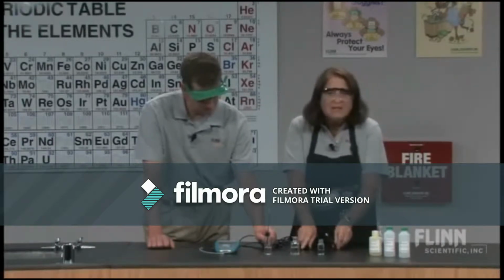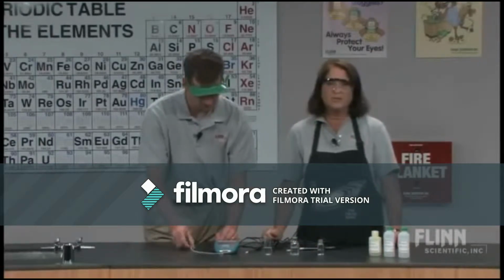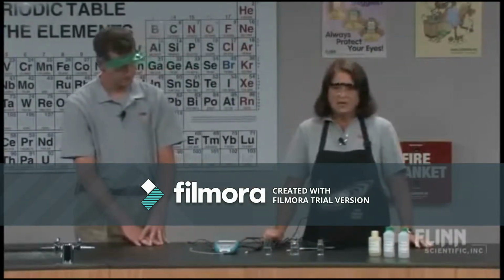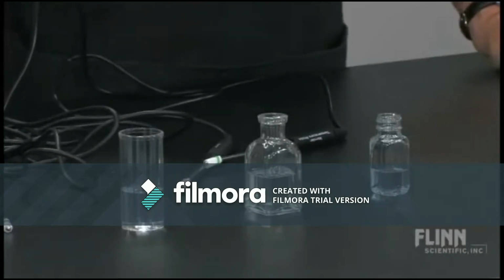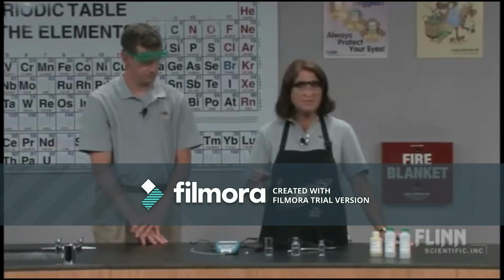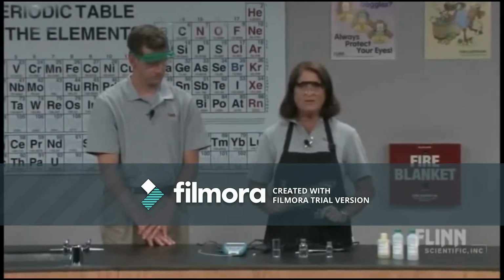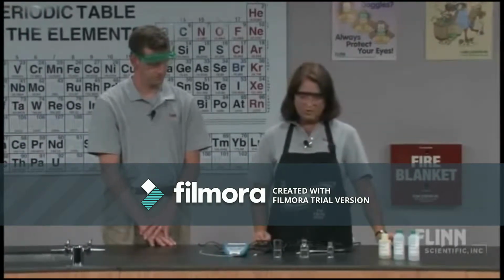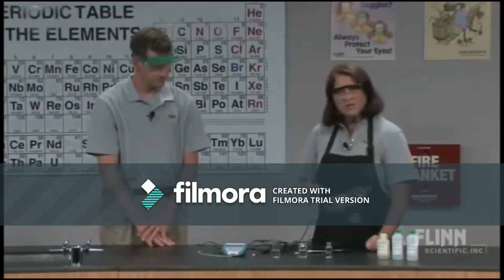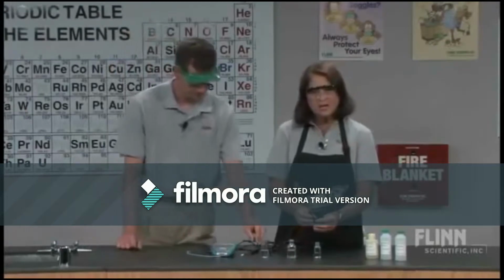Now, to make this interesting, I have 3 different containers here. Each of the containers is one of these alcohols, but I haven't labeled which is which. We're going to do the experiment, look at the data, and then try to determine which alcohol is in each of the vials from the data that we record. The only instructions I then give my students is to take the probes.